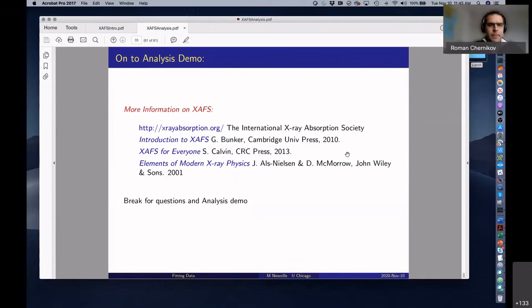Good. So I will start if no one minds. I have a question about the multiple scattering paths. Usually, if the structure is more or less complicated, you have a lot of multiple scattering paths building up some peaks. So is there any sense to include this fitting in the model, and how to deal with the Debye-Waller factor and the other parameters in this case?